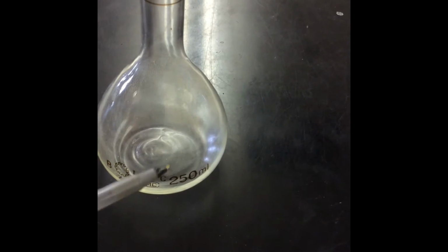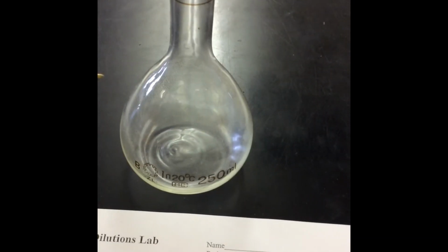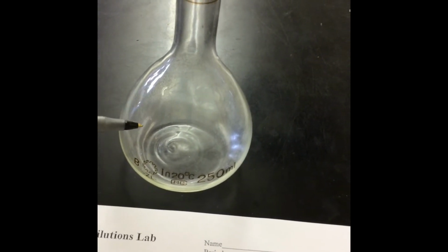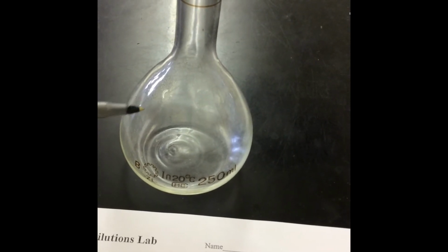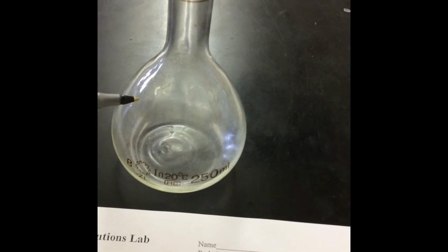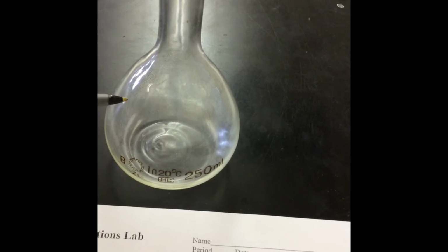Now we are also going to use food dye. You want to add in 1 drop of food dye, because that is something that will help you answer questions at the end. So what I do is dump in the solid, add the 1 drop of food dye, add water so it's like most of the way up this curved part. And I only added up to that part at first because now when you shake it, there's plenty of room for the liquid to move around, and it should help that sugar dissolve.